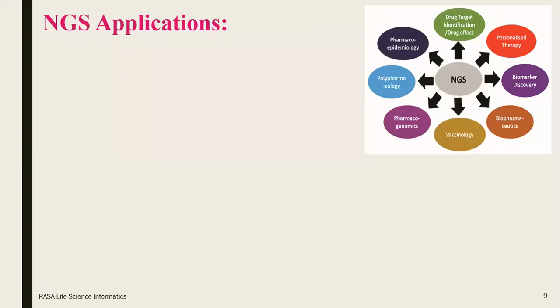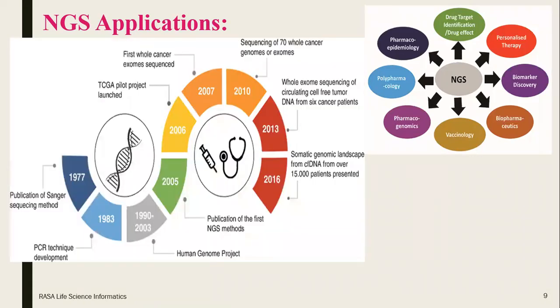Let us also see what different applications of NGS technologies are. First being the DNA sequencing, gene regulation analysis, sequencing-based transcriptome analysis, detecting SNP or variations discoveries, as NGS captures a broader spectrum of mutations than Sanger sequencing. It is very popular for mutation detection. Then in cytogenetic analysis, ChIP sequencing, and small RNA discovery analysis.